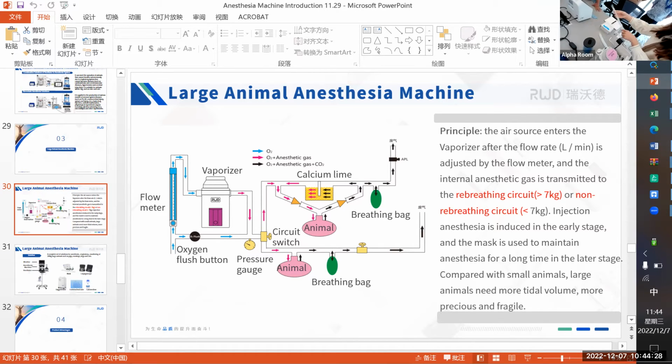That's true. For another mask that can connect with a ventilator, I'm sorry, we don't have that. I want to ask about the use of the ventilator. You said it can be used with a stereotactic frame or ventilator, so I cannot understand clearly what is the function of the ventilator.